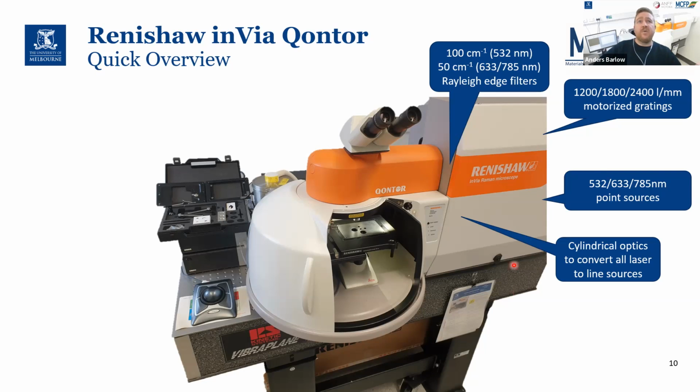Along with these, we have the different filters accordingly. We have a 100 wave number filter for the 532 and 50 wave numbers for the two newer lasers, the 633 and the 785. This is basically how low or how tight we can go to the Rayleigh edge and still see a Raman signal. We have 3 different gratings on our system: 1200, 1800, and 2400 lines per millimeter gratings.